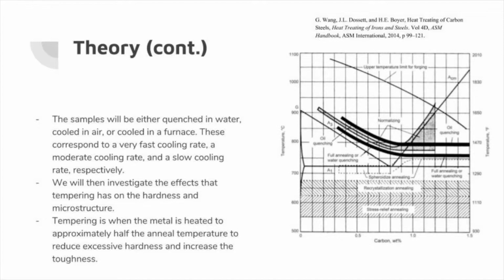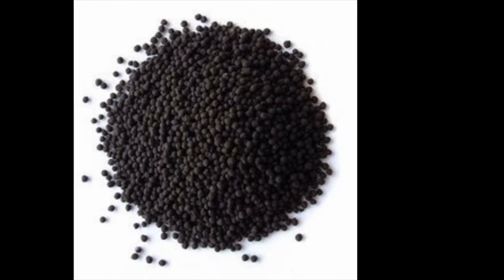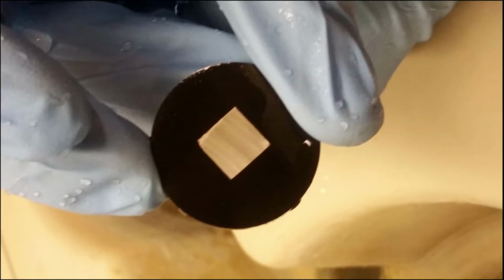and increase its toughness. Because ordinary resin mounts are too weak to support steel during polishing, bakelite is needed to form a stronger mount. Bakelite, though stronger, requires mounting in a high-pressure furnace to properly form and mount your sample. Once mounted, the polishing process can begin. Polishing is fairly straightforward in that you polish at low grit and go higher until the surface is sufficiently smooth for etching.